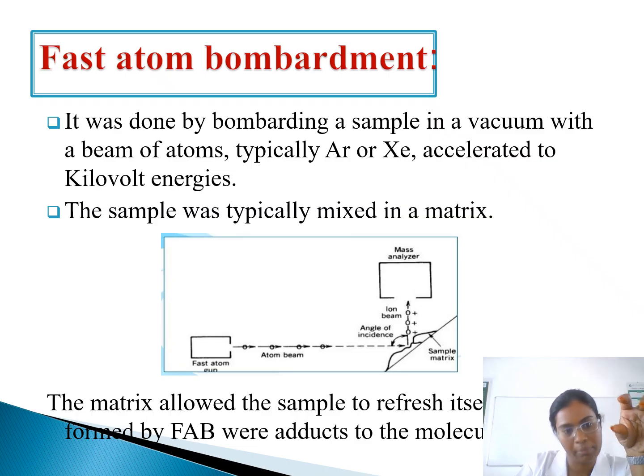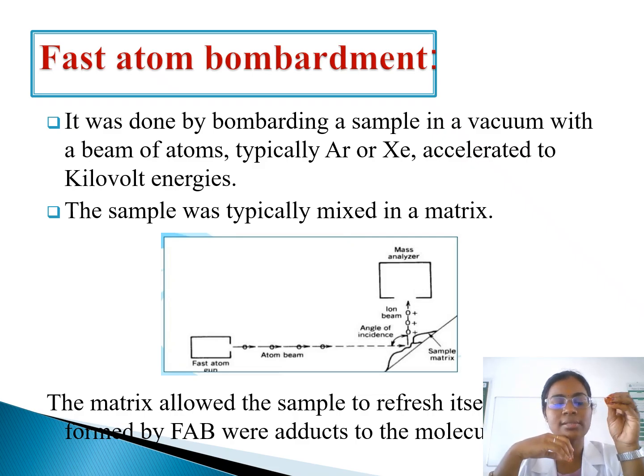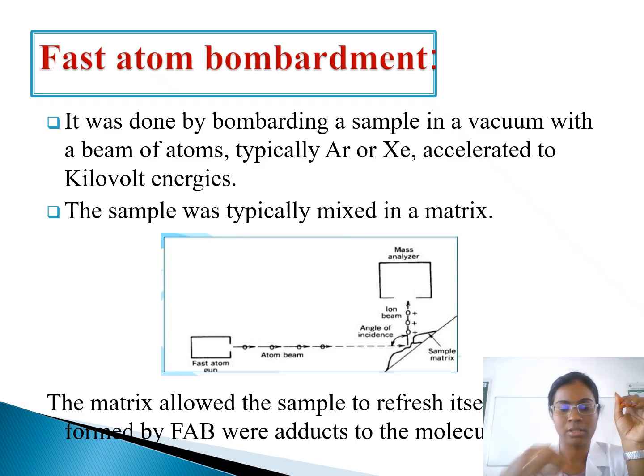Fast atom bombardment. Bombardment means hitting the sample molecules in a vacuum with a beam of atoms, typically xenon accelerated to kilovolt energies. The sample is typically mixed in a matrix.